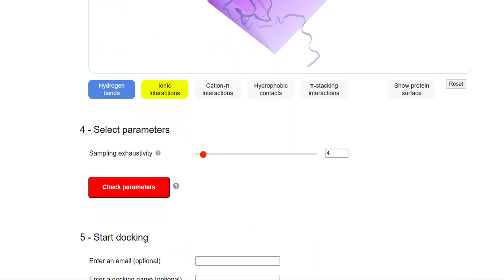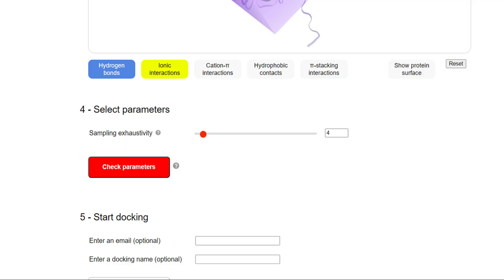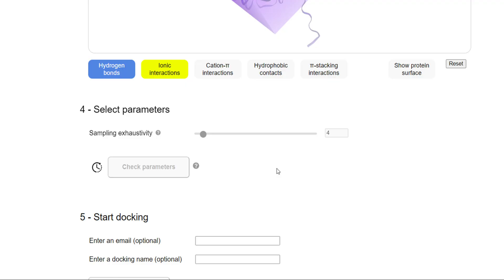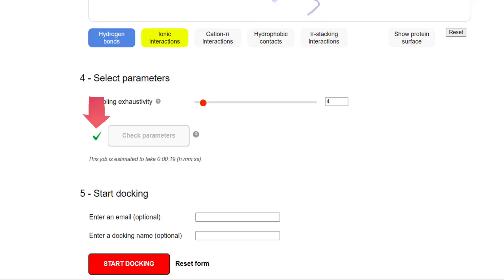After setting the grid box, scroll down and you will find the fourth option: 'Select Parameters'. Here you need to select the exhaustiveness level. By default, this is set to 4. You can change that value, but keep in mind that increasing the exhaustiveness level will make the docking procedure take longer. If you are comfortable with 4, click the 'Check Parameters' button. This may take some time, and once done, you will see a green tick appear next to the 'Check Parameters' button, meaning all parameters are verified.